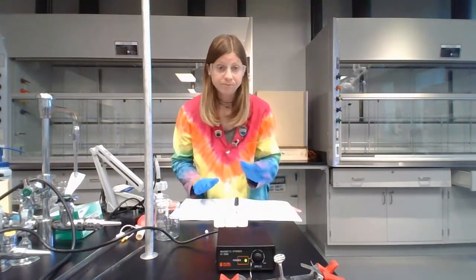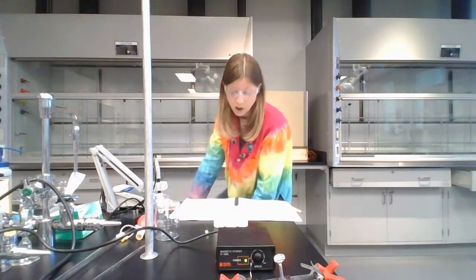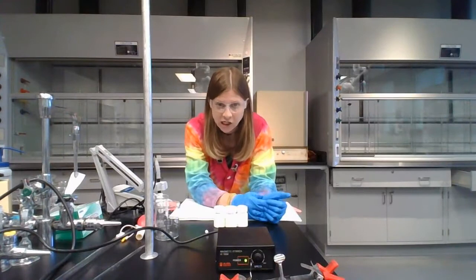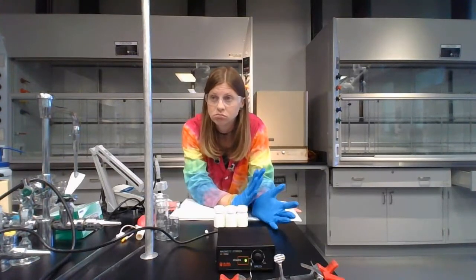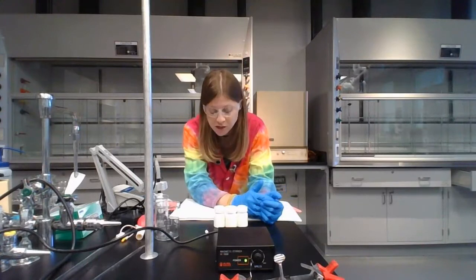So for part B, which is the rest of the lab, you're going to be doing 3 titrations. These titrations will be using a pH meter instead of an indicator, so there will be no color change. We will know when to stop the titration when we see a jump in pH value that's going to come from looking at the pH meter.